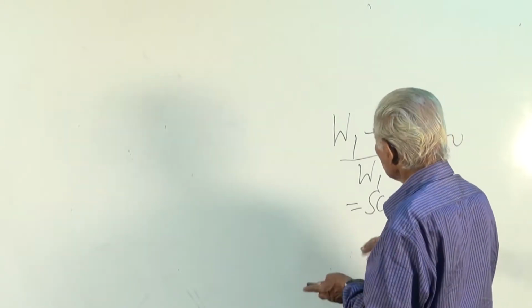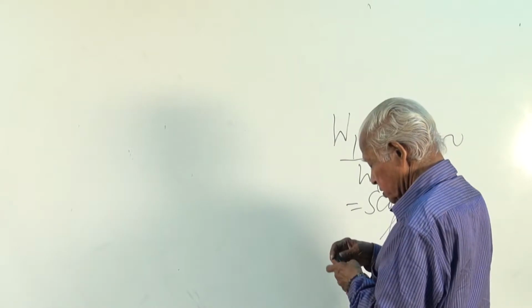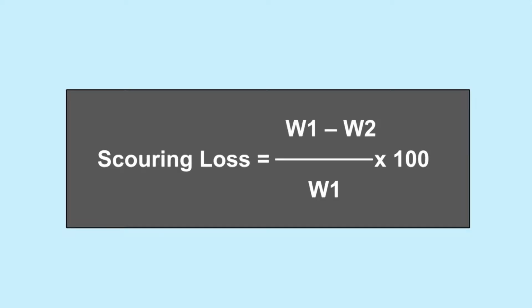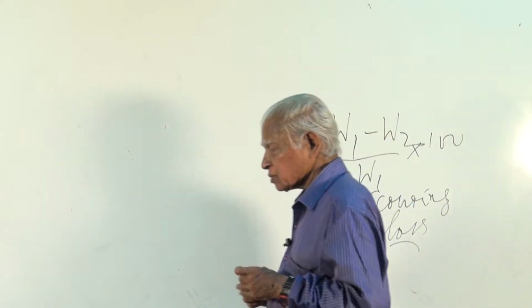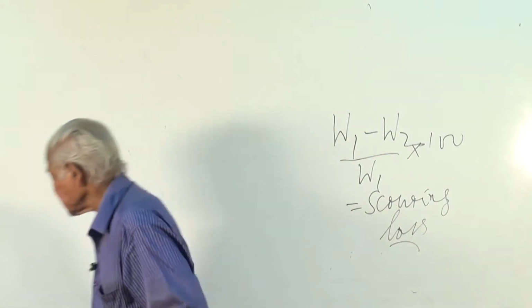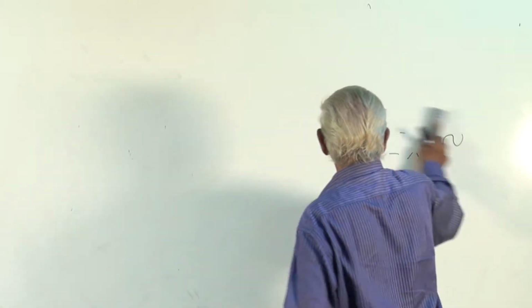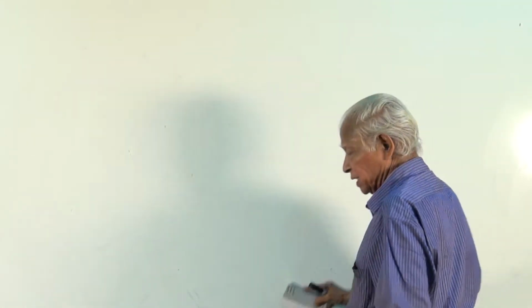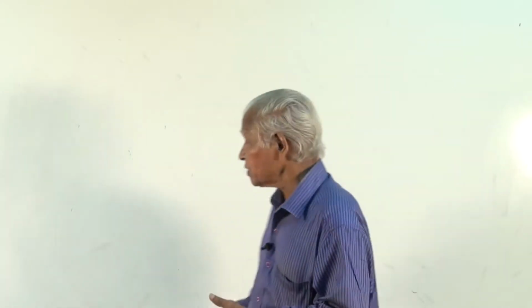After plasma treatment also the weight can be determined, the percentage loss in weight can be determined by using this formula. So these are all some very simple tests which can be done to find out the various losses. And reporting the weight loss is very important in the case of enzymatic treatment or with treatment with enzymes or with sodium hydroxide even.